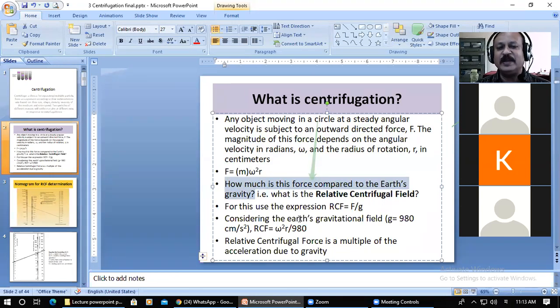Because you know that any heavy object is going to fall to the ground, isn't it? And that is because of the gravitational force. Now, when we put particles in a liquid, these particles are also going to settle down, or sediment, depending upon their own density. But the problem with bacteria is that they cannot easily settle down at the bottom of the liquid on their own. By virtue of gravity, they will not come down to the bottom of the container.